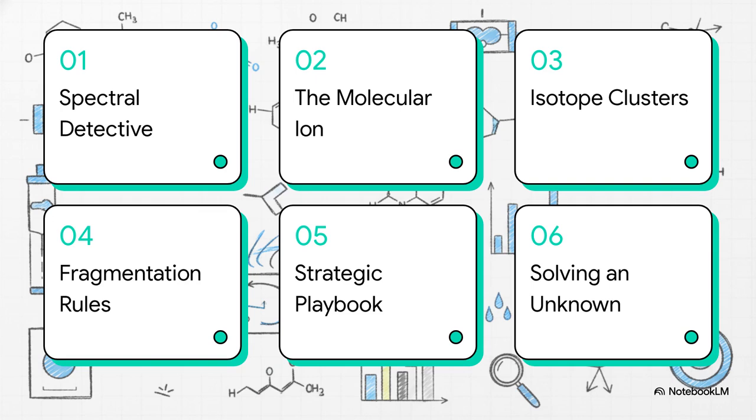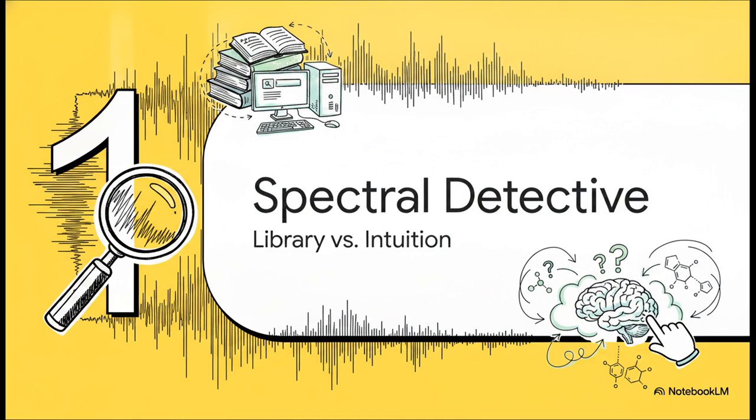We'll start with the concept of the spectral detective. Then we'll find our molecular ion, decode isotope clusters, cover the actual rules of fragmentation, build out a strategic playbook, and finally, we'll solve an unknown compound together. Part 1. The Spectral Detective.